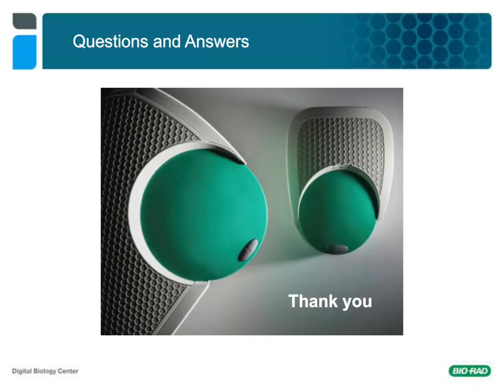Thank you very much for that response. So moving on, you mentioned copy number and mutation detection assays for digital PCR. Do you have any gene expression assays available for ddPCR? Absolutely. Recently released on the website are thousands and thousands of gene expression assays. The nice thing about gene expression assays is that they can be multiplexed, 3 or 4 different targets or references, however you want to do your combination, in one well fairly easily.